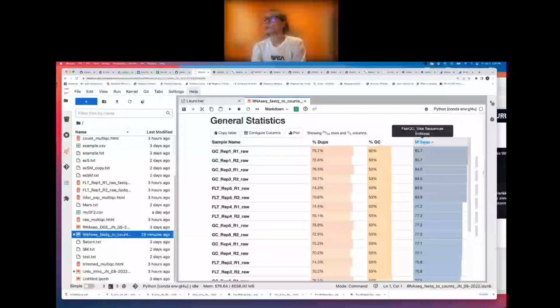What you can do is, you remember we have that cat command where we can open up an entire file? You can open up your FASTQ file and pick a certain number of lines. So if you get your samples back and half your samples have 50 million reads and half have 100 million reads, you could take the first 50 million reads of the samples that have 100 million and throw those other 50 million reads away.